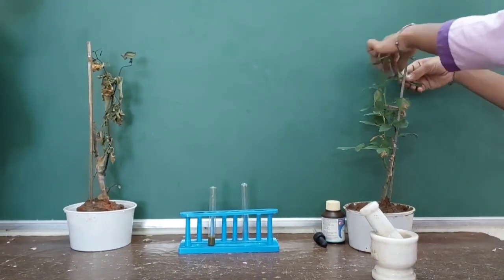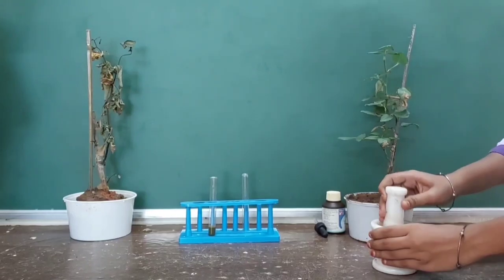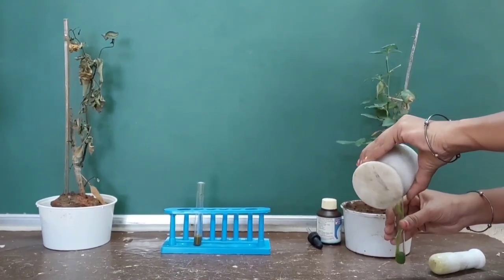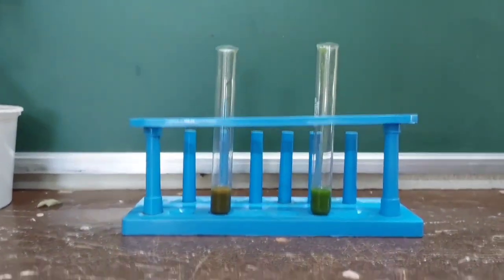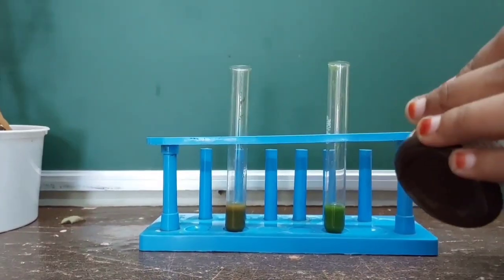Now take some leaves from the plant kept in sunlight, add a few drops of water, and mash them to make a paste to get the extract. Collect this leaf extract into another test tube. For better observation of the results, take the leaf extract of both plants equally in two test tubes.